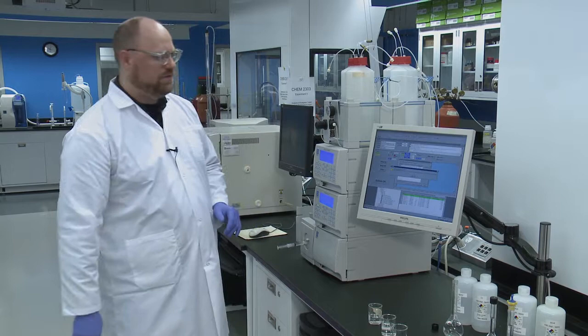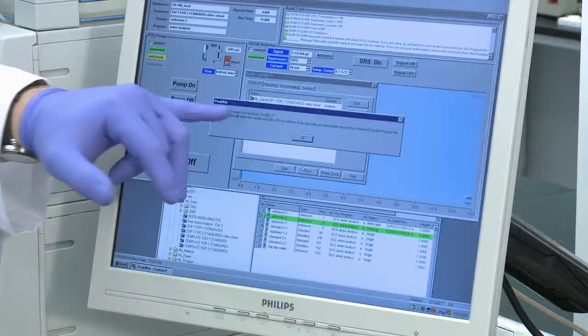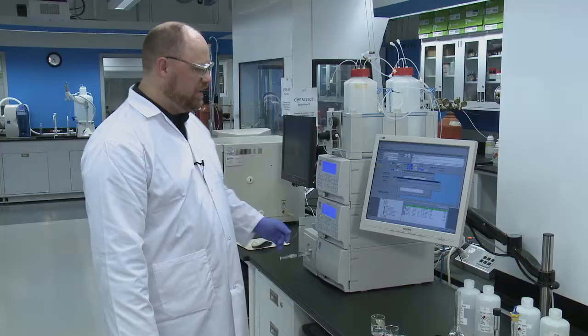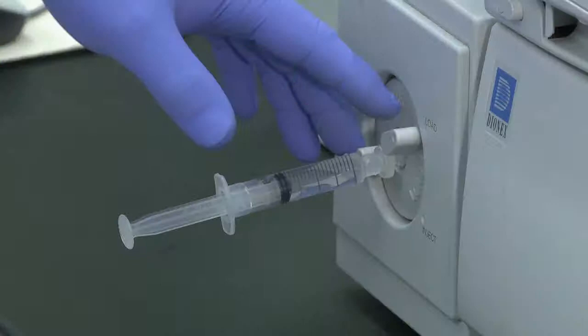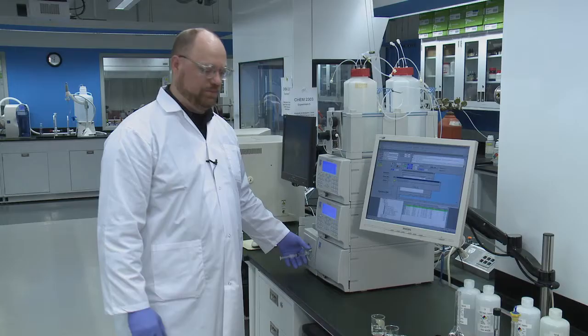And there we are about our cc. Now we're going to leave the syringe in. Your TA or the lab coordinator should have set up the computer so that it looks something like this. It's basically asking for an injection. So what you're going to want to do is you're going to want to turn the injection port from the load to the inject position at the same time.